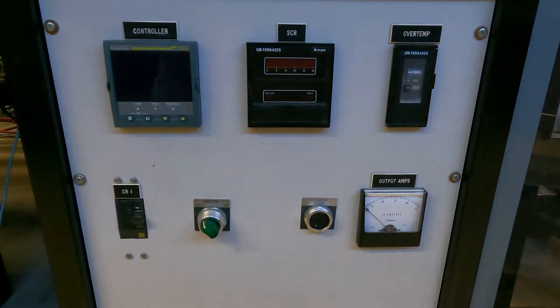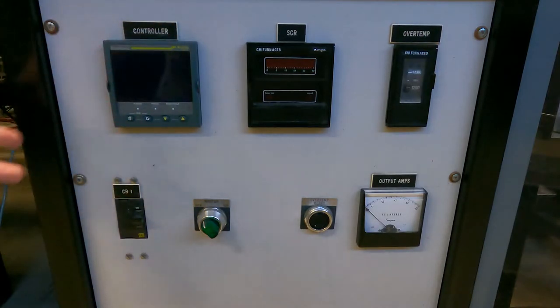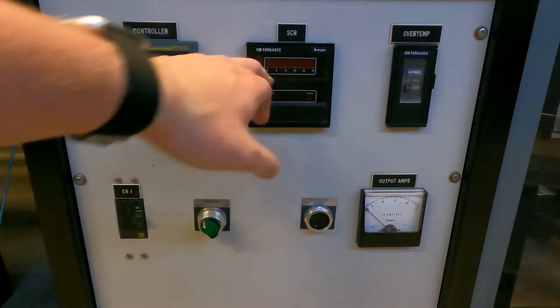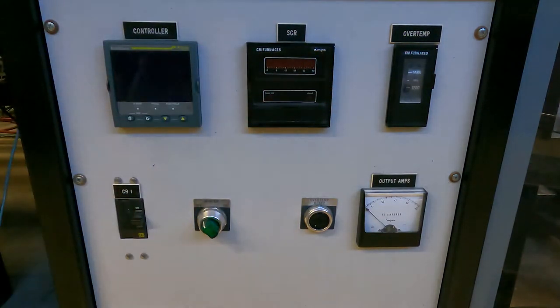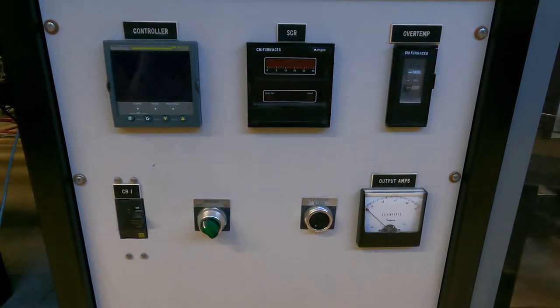The overtemp reader — some of our other ones have a digital reader, this one's analog. Basically what these do: the controller does what you think it does — it controls the temperature of the furnace with respect to time. The SCR is like a relay, so it controls how much power is going to the furnace, which is why it also has the amp meter on it. The overtemp is essentially a safety: if it gets above a certain temperature, it will automatically go into reset mode and turn off.